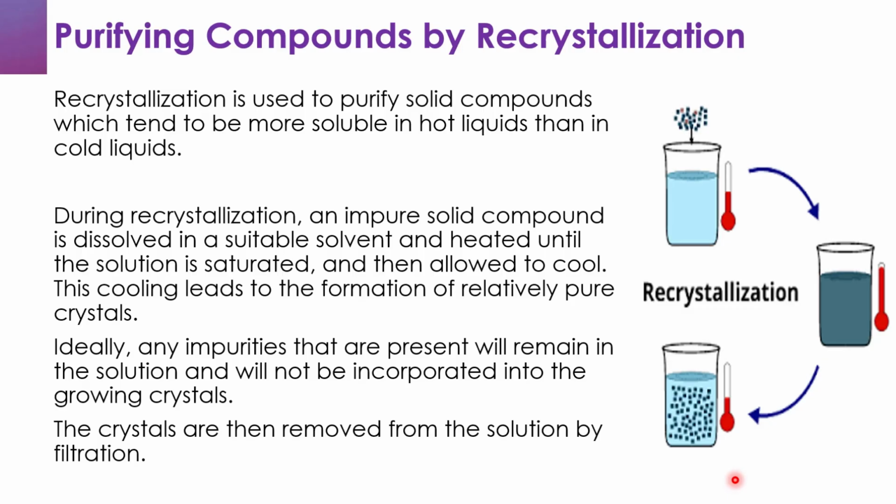Recrystallization is used to purify solid compounds, which tend to be more soluble in hot liquids than in cold liquids, as said earlier. What you also have to note is that during recrystallization, an impure compound, as we can see, this is our impure compound over here, is dissolved in a suitable solvent.